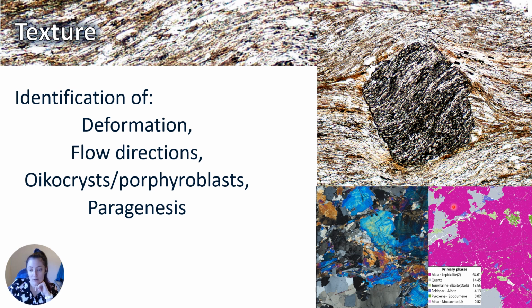So here is an example of observing texture in a thin section that we can't really see if we're looking at SEM or TIMA. So if the minerals that are touching each other are the same composition, the SEM and TIMA will just display them as the same color or the same backscattered brightness intensity. But if you look at it in thin sections, you can see where one crystal ends and the other begins and understand how each crystal relates to each other, and whether or not you have like microcrystalline aggregates or just one very large crystal.